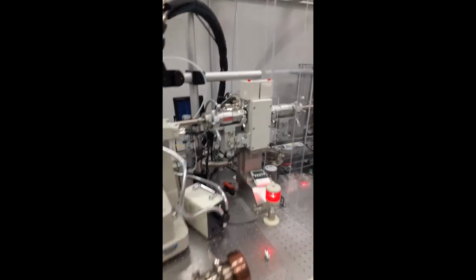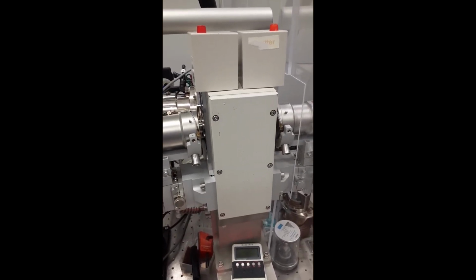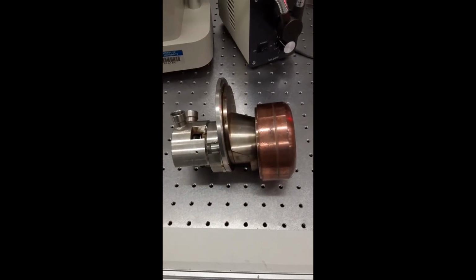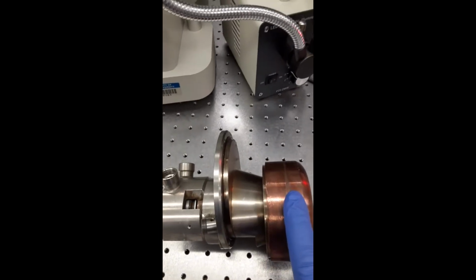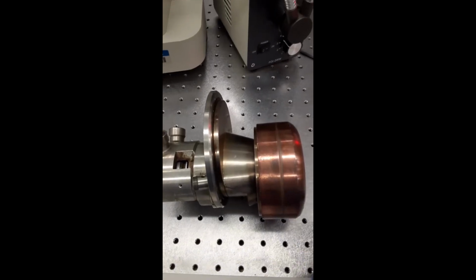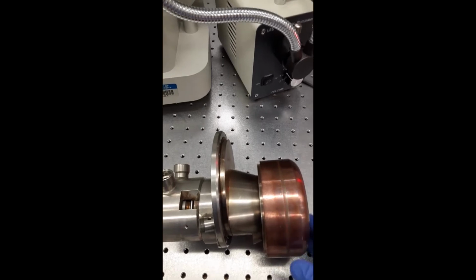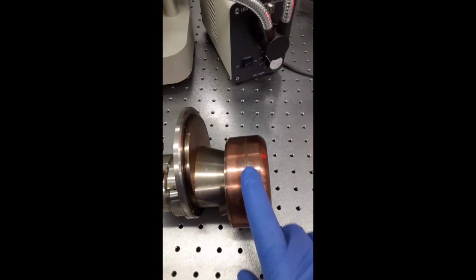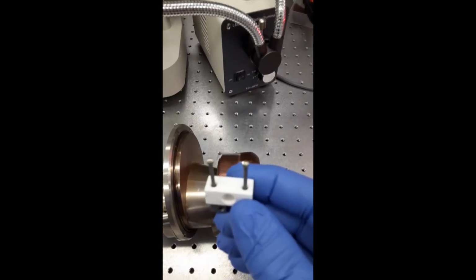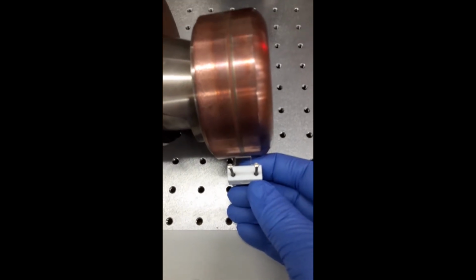At the center of our system is this copper box known as the tube tower. Inside the tube tower is a high vacuum, and also inside is what's known as the rotating copper anode. So this anode is made of copper, and that choice of metal gives us the characteristic wavelength we want. And by rotating, I mean this section here will rotate at high RPM during X-ray generation. I'm calling this the anode because that's one side of the electron's current. This is a cathode made of tungsten, which is located inside there and sits approximately here.